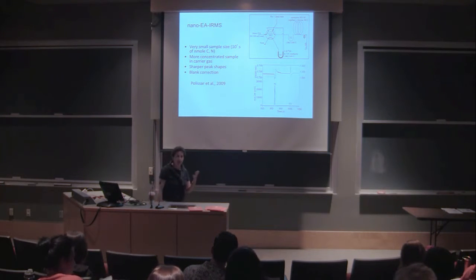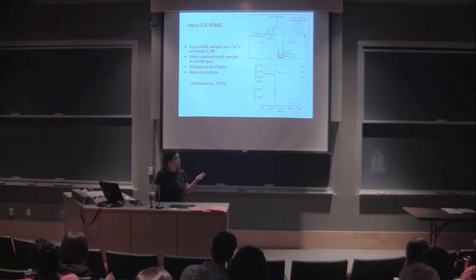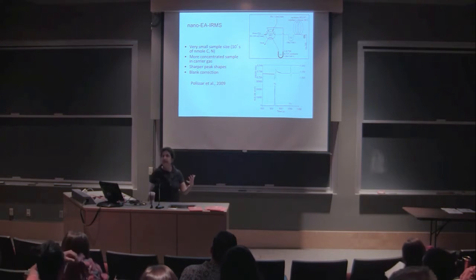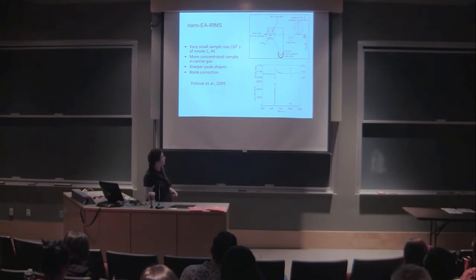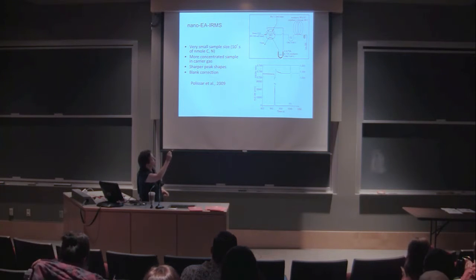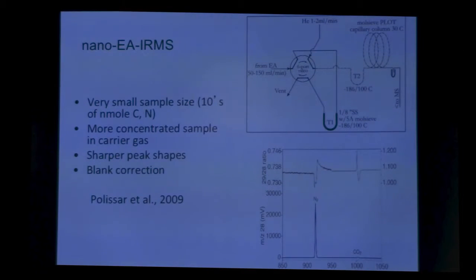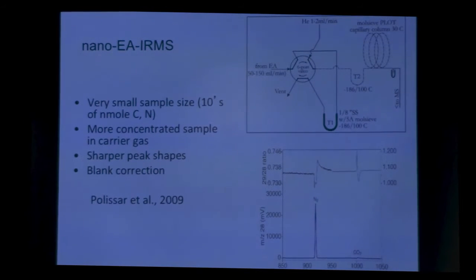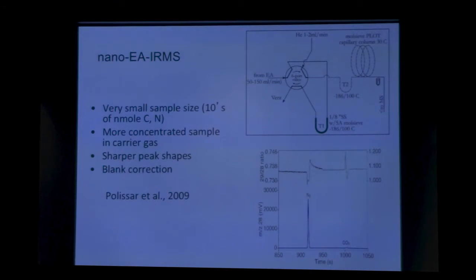And that's what led to our device, which we call a nano EA. This is actually not entirely new, and a lot of this early work is based on early work by Brian Frey, who was doing basically this, but in an offline technique. And we just simply plugged it into our mass spec. But the idea is your EA effluent comes in here, and you run it through a cold trap. You collect the gases for a window of time, and then you switch that flow so that it goes into a narrow and higher separation column with higher separation power, and then you can separate your CO2 and your N2 and anything else. And you end up with sharp peaks.